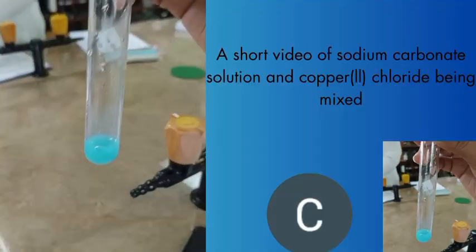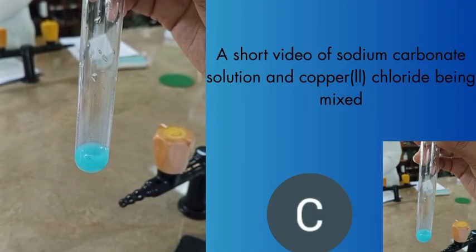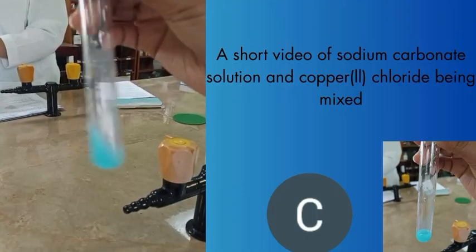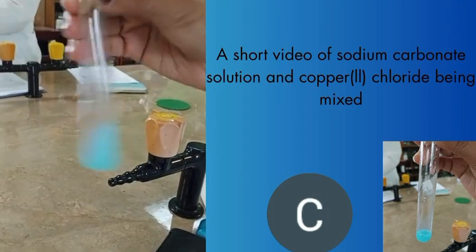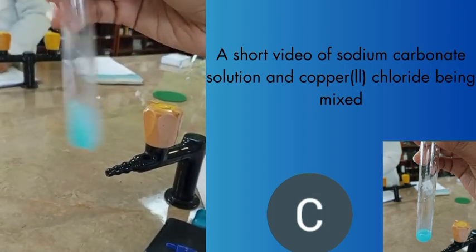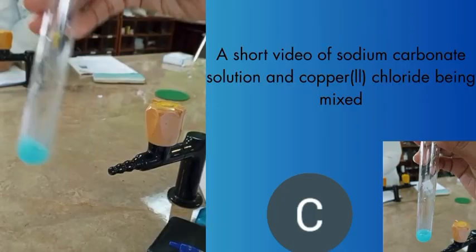The goal was to react a known total mass of a copper 2 chloride and sodium carbonate mixture completely, and use the mass of the solid product, copper 2 carbonate, to determine the percentage composition of the original mixture and to identify the limiting and excess reactants. After mixing, there was a sort of blue-green precipitate.